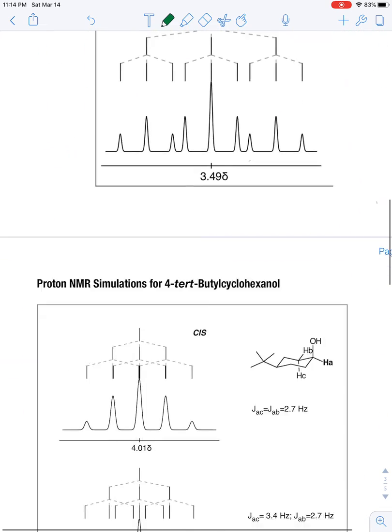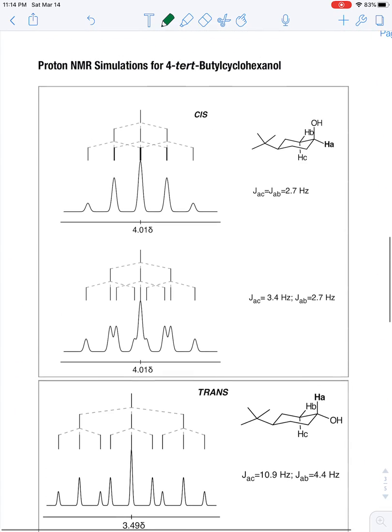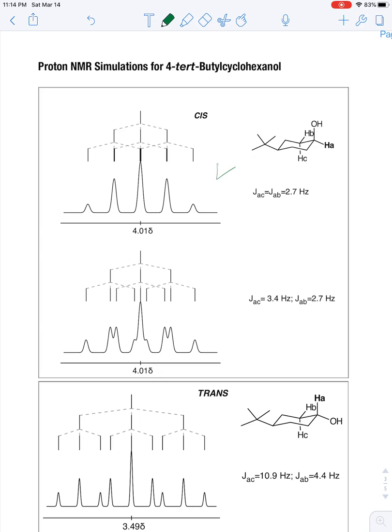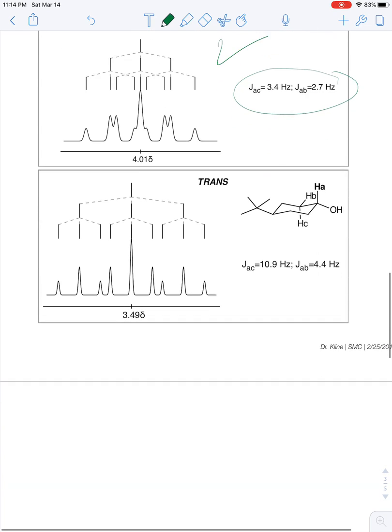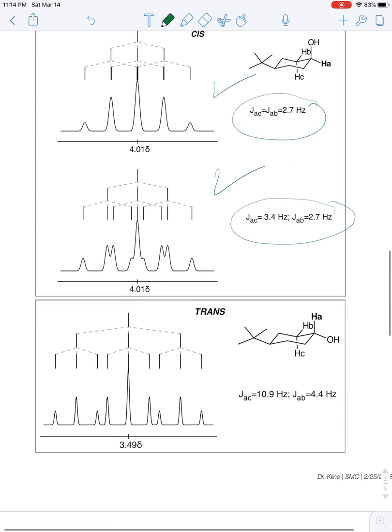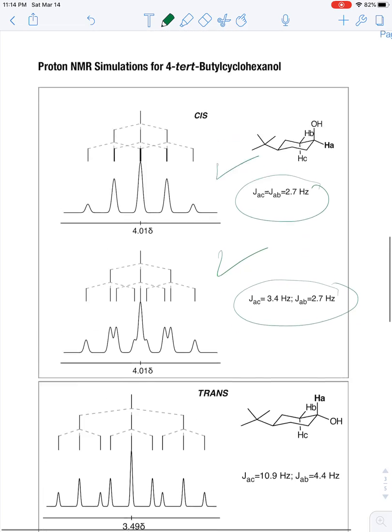The full handout looks like this. It shows the cis product, and you can actually see the coupling constant values that I used. Then it also shows the trans product, and we're going to deal with the trans product next.